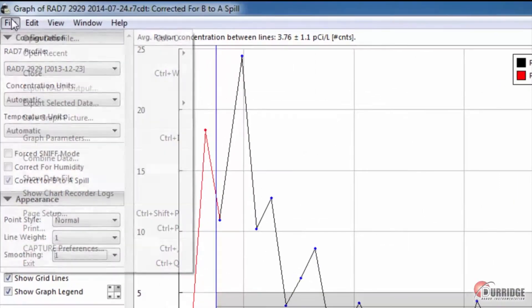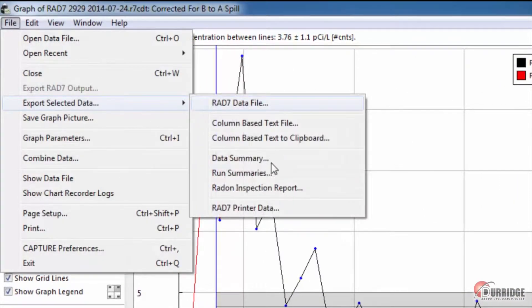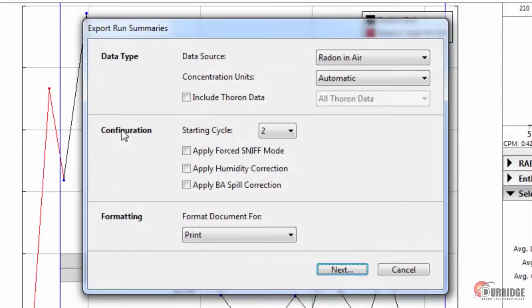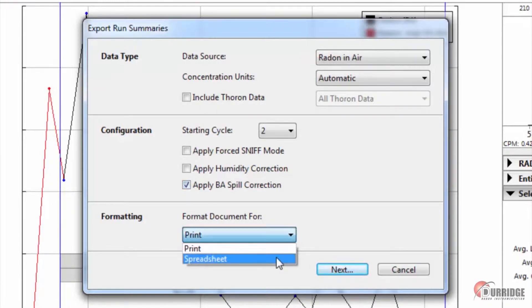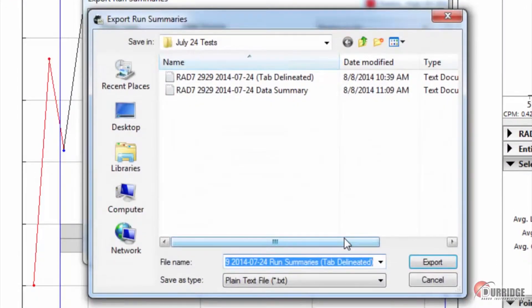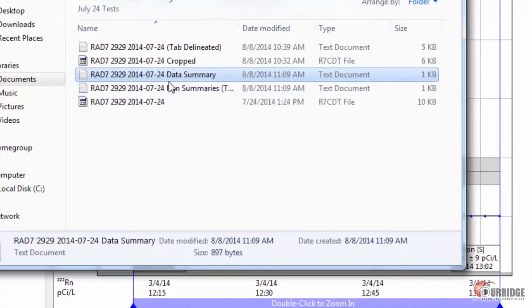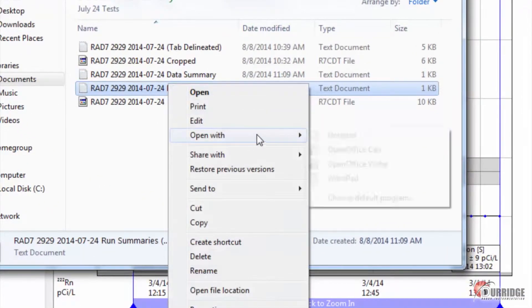Exporting as run summaries saves the data as a text file with information for each run. If you select this option, you need to go over Data Type and Configuration, selecting your corrections, and choose Formatting. When you click Next, pick the file name and location, and then click Export. If you choose Formatting as Spreadsheet, you can import the file into your spreadsheet-based program.